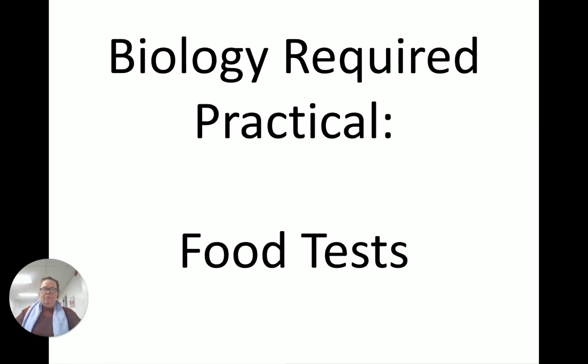Hi everyone, welcome to the next Biology Required Practical, which is the food tests. This comes up a lot, not only to do with food, it comes up to do with testing starch in leaves. It might come up in other areas as well. So just be aware of, first of all, the reagent, so the chemical we use and the colour that it goes. Okay, so let's have a look, let's get into it.